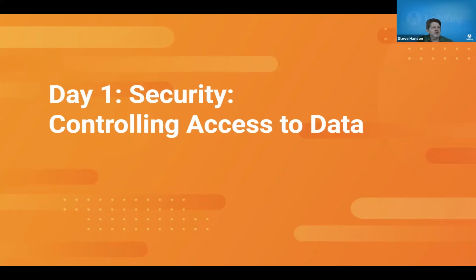All right, well, let's get going here, heading into the security part of the day. Although I did notice there's two questions I missed, and I wanted to at least talk to them about data grids. First, someone asks, what is the difference between list and assay?